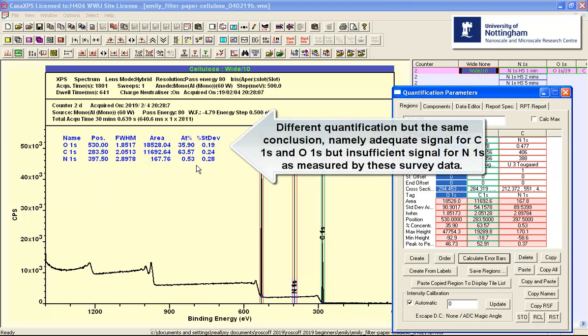And once again, we come up with uncertainties that are definitely supporting the use of these peaks as being oxygen and carbon. Whereas once again, the nitrogen, well, this is again about two standard deviations indicating that we don't have a high degree of confidence in a nitrogen peak in this part of the spectrum.